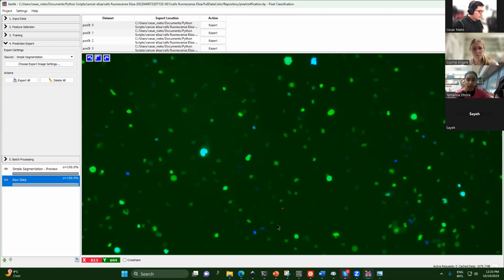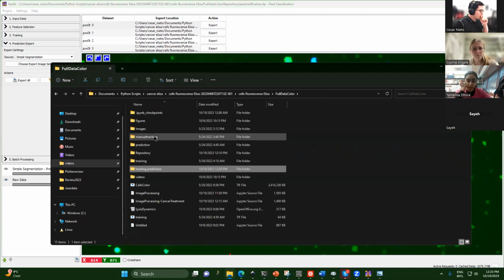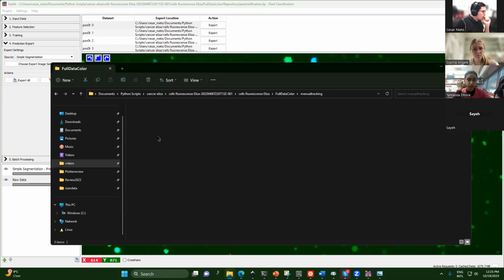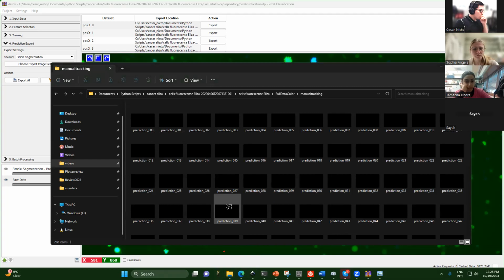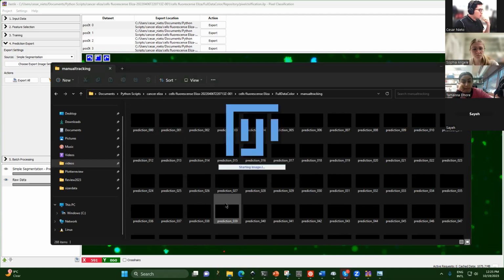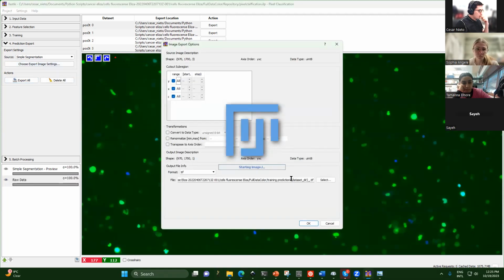But if everything is fine, what you're gonna get is this kind of file. You can open it here in Fiji, and it corresponds to an image of masks. Here I changed the name to prediction 00. Maybe it's the name, but I don't remember how to modify the name.